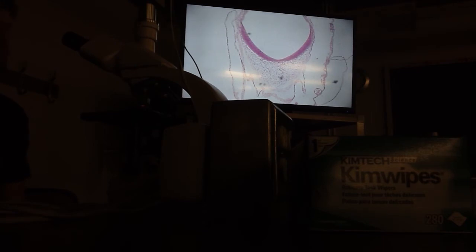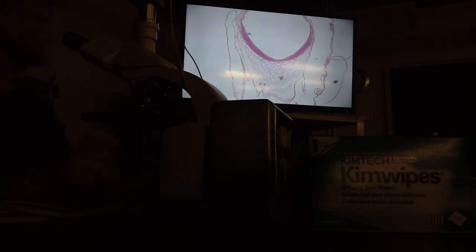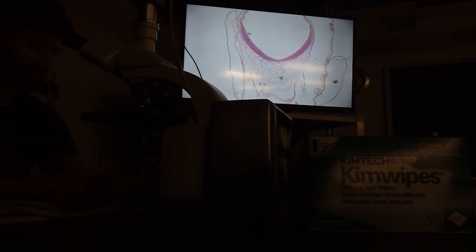We are in the head. It is posterior. We are anterior to it. Follow in your mind? So you have to think about the pattern of this. All right. Is that not the yolk right there, that line? You said that's chorion? These membranes are broken. We never showed this to you on an exam. Okay, I'm sorry. It is confusing because it is broken.